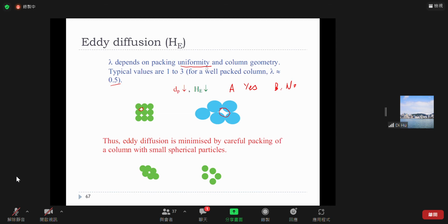No, thank you. Very good. So why? Is it because capillary GC has packed particles? No, it's not. The stationary phase is coated on the inner wall of the capillary, right? There are no particles packed inside capillary GC. We're not talking about a packed GC column. We're talking about capillary GC. So that's why this term does not play a role in capillary GC, but it does contribute in liquid chromatography. Okay, so good.